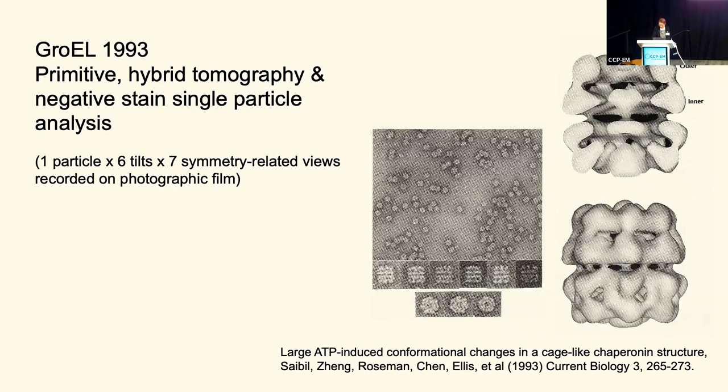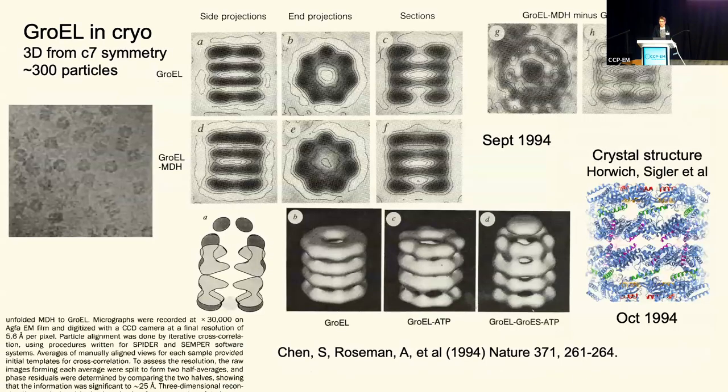And then Xiao Chen was in the lab, and she got the cryo to work. While I was at that Gordon conference, we'd been trying on an old JEOL microscope, a 120, to get cryo to work, and we didn't know how to get the ice thin enough. But while I was away, she got this image. I think this is 80 kilovolts, and you could see the molecules in ice. And that was really exciting, because then you could do cryo single particle.